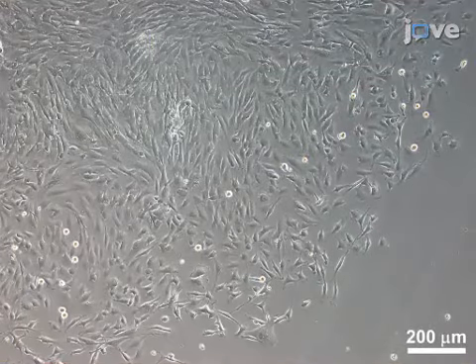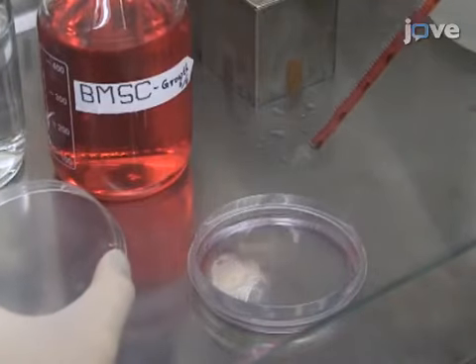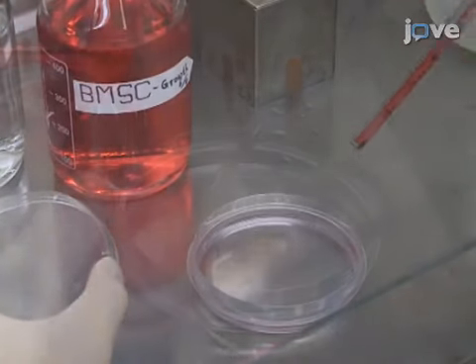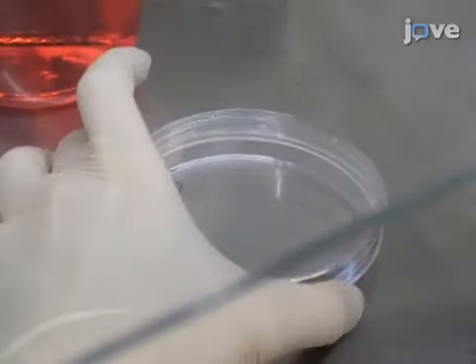Visible colonies should appear by day 6 to 7. On day 10, wash the culture in fresh PBS and detach the cells with 1.5 mL of recombinant enzymatic cell dissociation reagent.